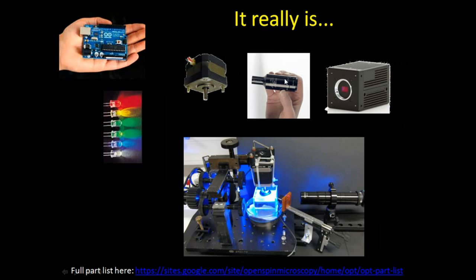And being a biologist, I already have pretty much mastered these. Through the help of colleagues, I learned a little bit about robotics and put it all together, and this is what the system that I call OPenT kind of looks like, or looked like in the original configuration. It pretty much still looks like this.